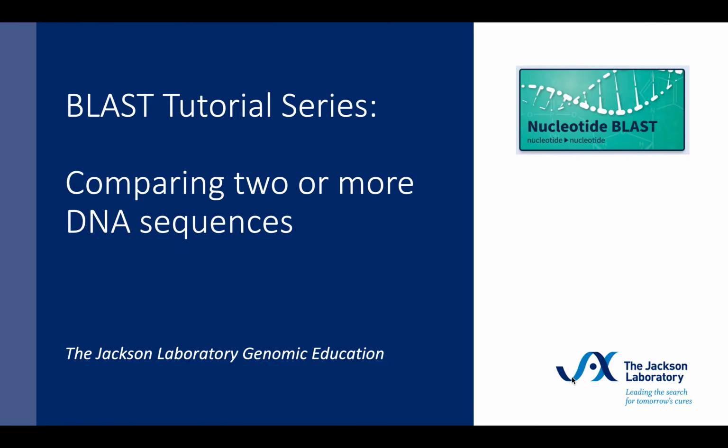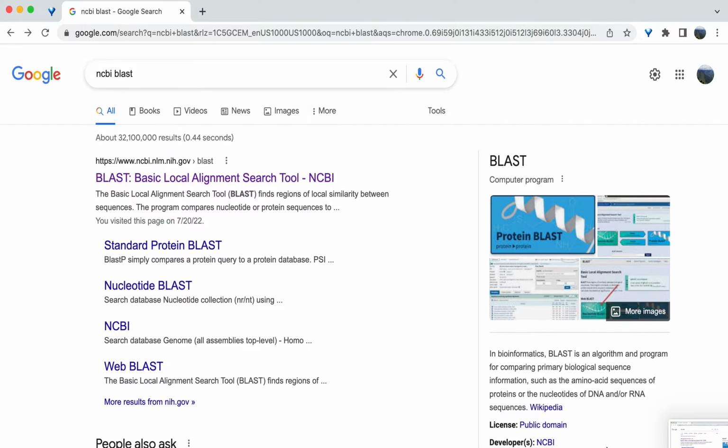This tutorial is a demonstration on how to compare or align two or more DNA sequences using Nucleotide BLAST. BLAST is a powerful tool that allows you to compare and identify variation between two or more DNA sequences. BLAST will use sequence alignment to accomplish this.